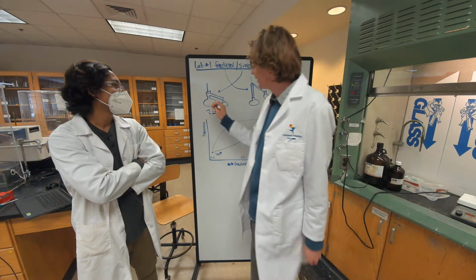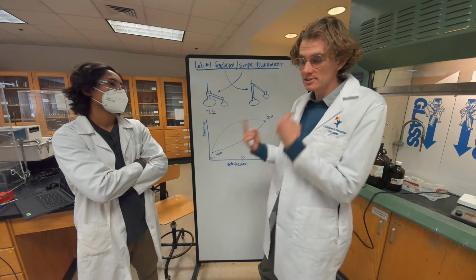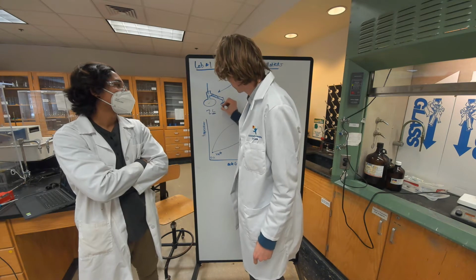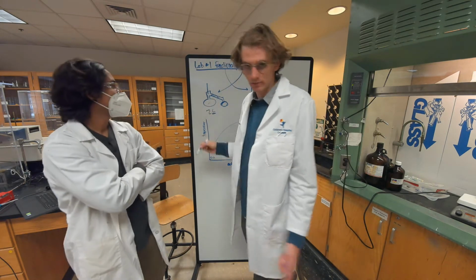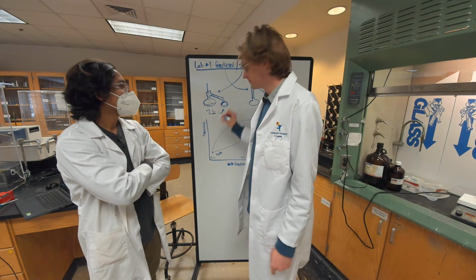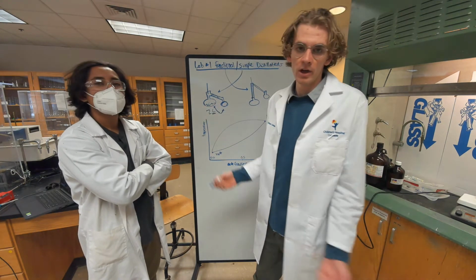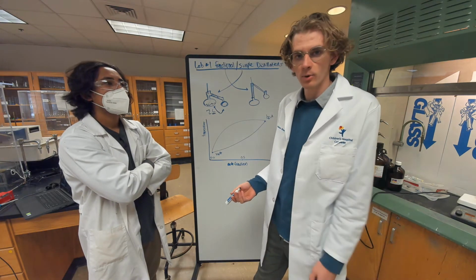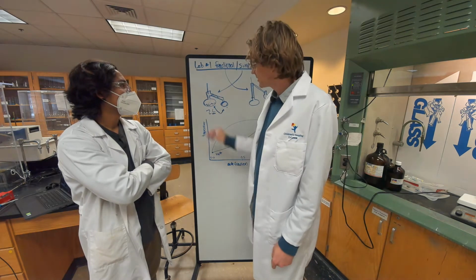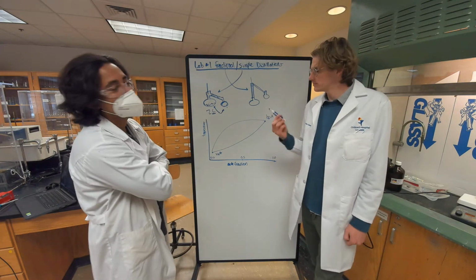Take two or more liquids, put them in a combined flask, and heat the flask. The goal is that these liquids have distinct enough boiling points that one of them will rise in vapor phase, condense in the condensing tube, and collect in that little chamber there, while the other liquid, or variety of liquids, remains in the original chamber. And thus you pretty simply distill out one from the other. It could be water and ethanol. Ethanol boils at like 79 degrees Celsius, while water boils at 100. So if you set it at 79 degrees Celsius, you'll get ethanol in the container and you'll have water remaining there.